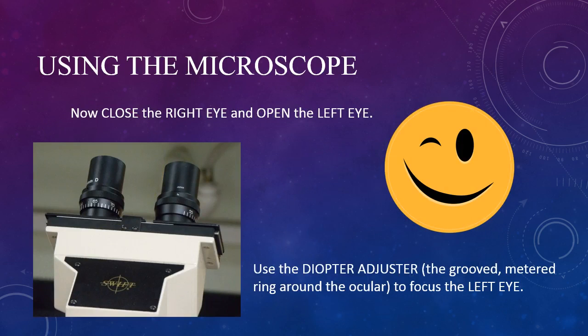Then we're going to switch eyes. Close the right eye, and opening the left, use the diopter adjuster — that grooved ring around the ocular — to bring the image into crisp focus for the left eye. Now, when both eyes are open, you should have a perfectly clear image for both eyes.